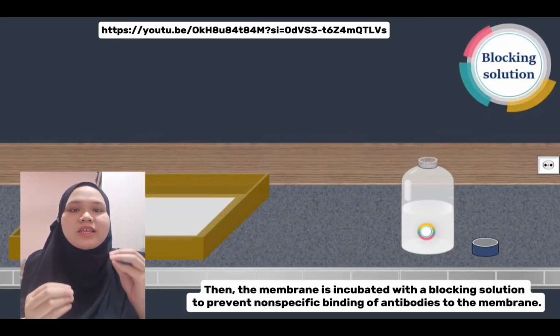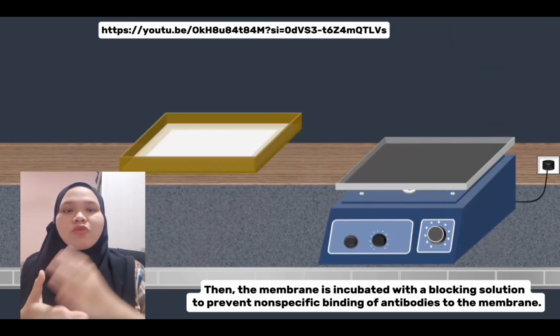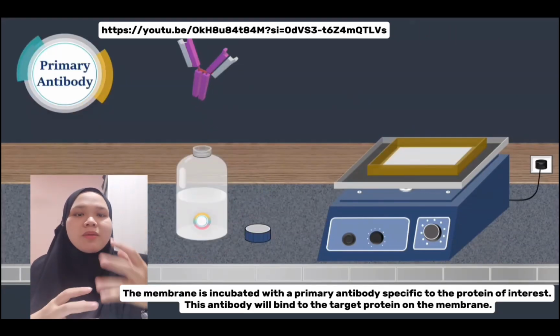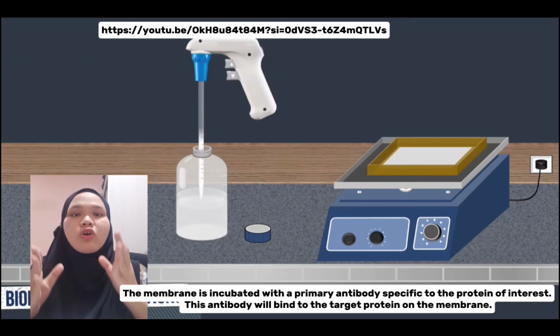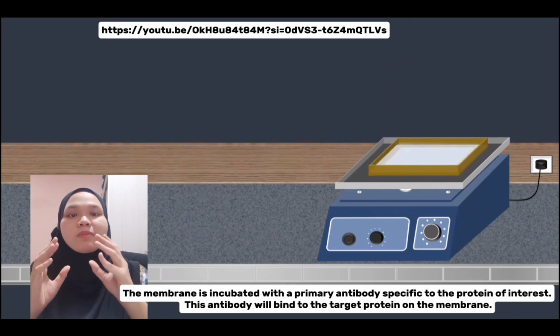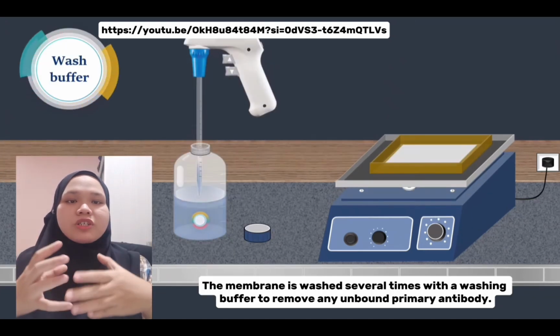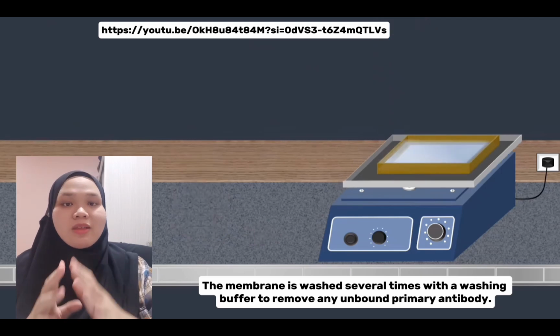The membrane is incubated with a blocking solution to prevent non-specific binding of antibodies to the membrane. The membrane is incubated with a primary antibody specific to the protein of interest. This antibody will bind to the target protein on the membrane. The membrane is washed several times with a washing buffer to remove any unbound primary antibody.